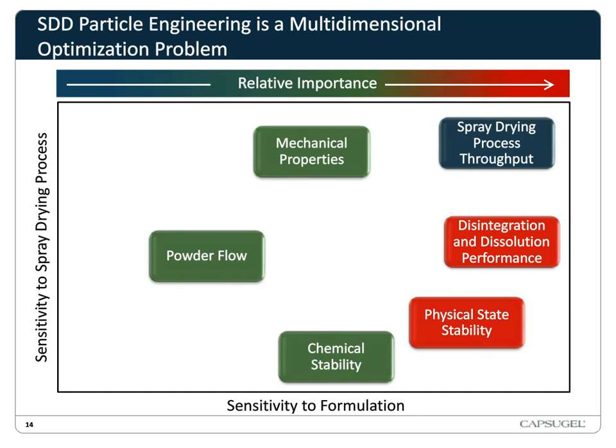Now, we further delineated these attributes into sensitive to formulation and sensitive to process conditions. These estimates are based on averages of our previous experience, and this isn't always the case. But an interesting note, for mechanical properties, normally with crystalline mechanical properties, these are only sensitive to formulation and not process, i.e. we can change crystalline drug mechanical properties by changing polymorphs or salt forms, but generally not by changing what solvent we crystallize from.